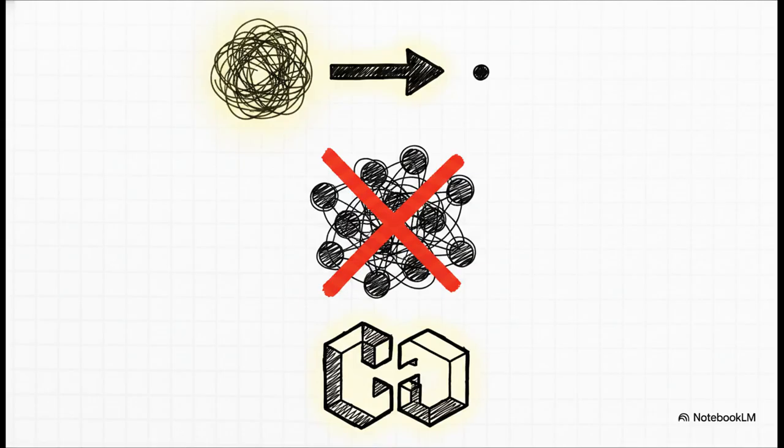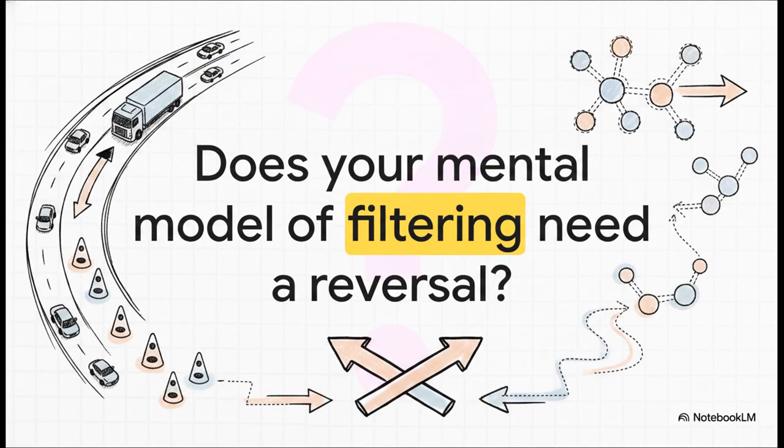But we do have to respect its boundaries. The column efficiency in SEC is honestly far from ideal. If you're trying to separate a bunch of very small intermediate molecules with similar sizes, SEC is just not the right tool for the job. And as we just mentioned, you always have to be careful that your calibration standards perfectly match the physical geometry of your sample. Which brings us to our final thought.